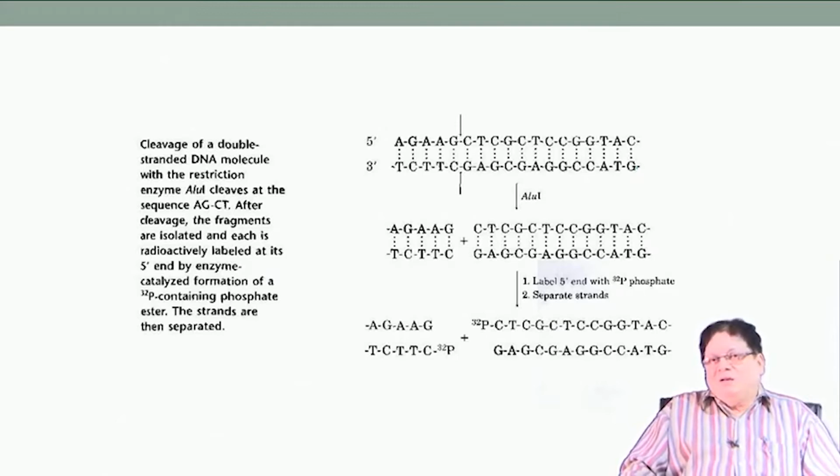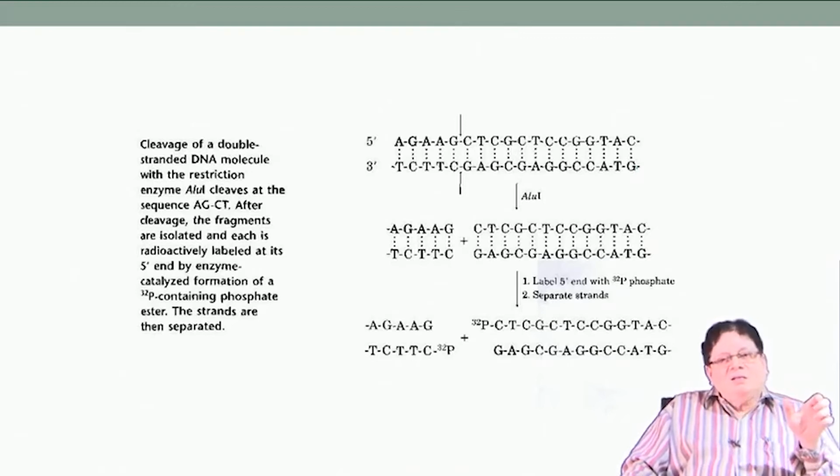It is very difficult to cut at very precise places, but enzymes can. Fortunately, there are enzymes which can cleave the DNA at particular points where there are some sequences which the enzyme recognizes, like chymotrypsin recognizes aromatic amino acids and breaks the peptide bond.